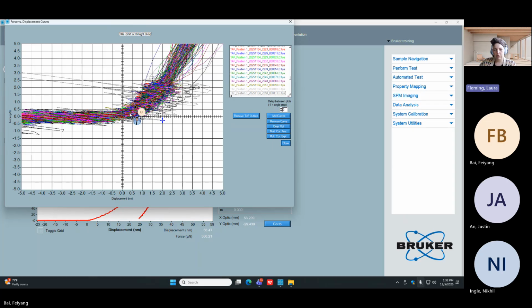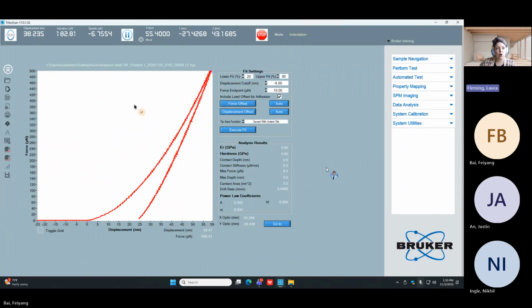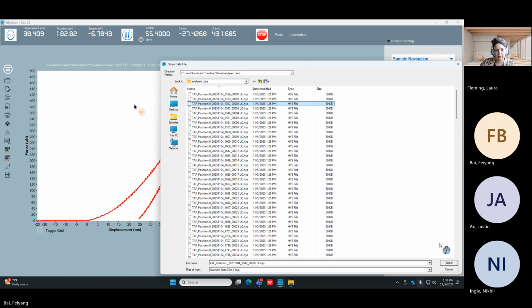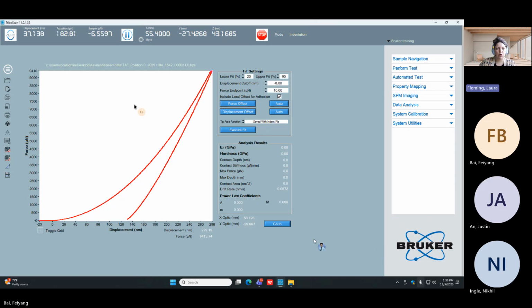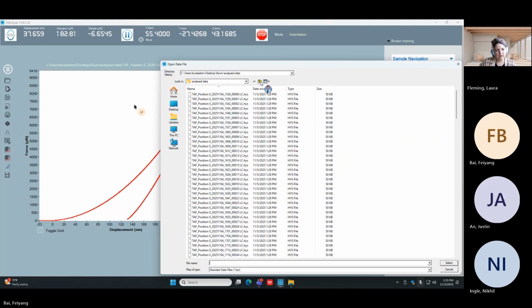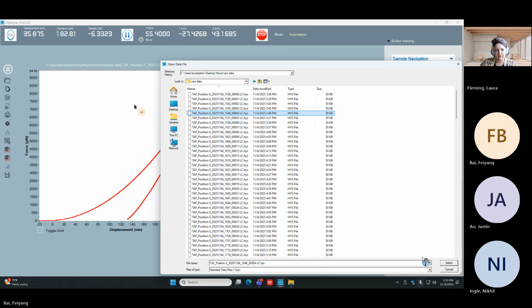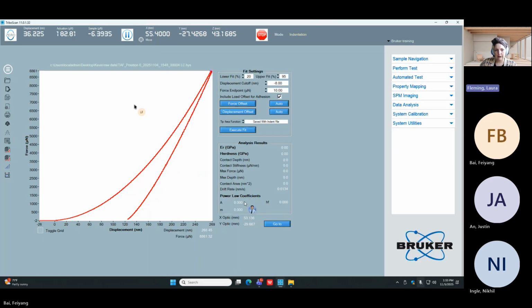Okay, go ahead and close this. And why don't you go ahead and open one of the raw data files to give us something real to work with. Sorry, let's open one of the raw files. So this is the analyzed files. The raw files are still not re-zeroed. That's why I want to use them for this demonstration. Okay, now go ahead and zoom in that same way that we've done.